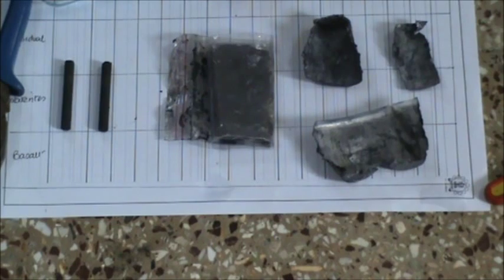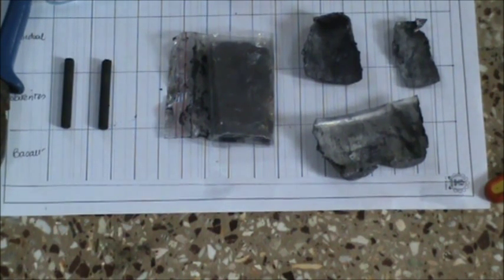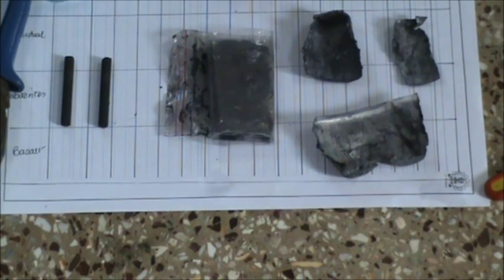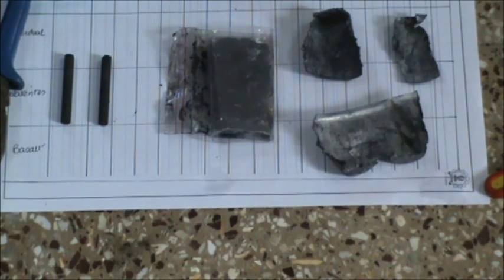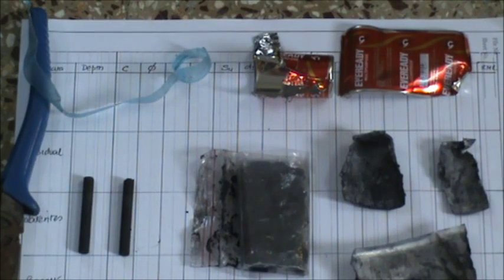Only non-alkaline, non-rechargeable batteries can be used. Please ensure that you are not using Ever-Ready, Duracell, or any other rechargeable or alkaline battery. All the extracted chemicals and materials should be stored properly.